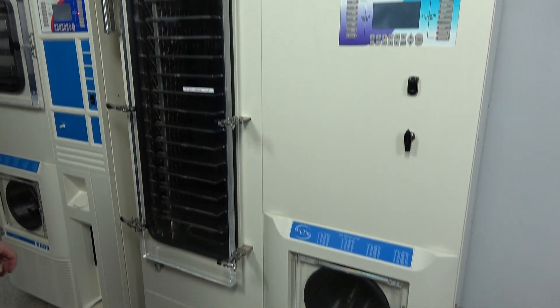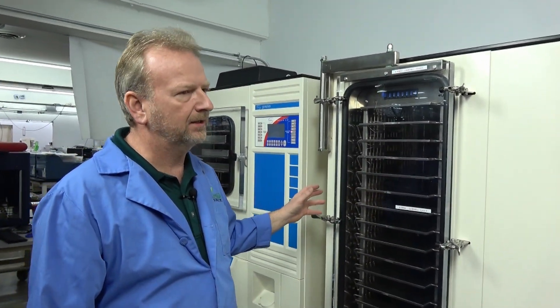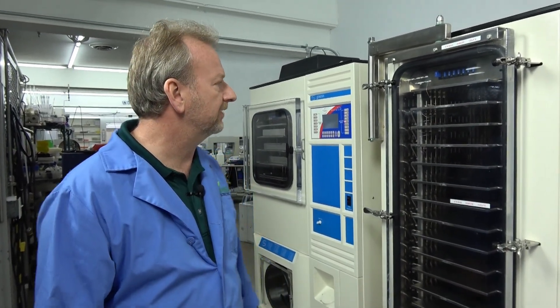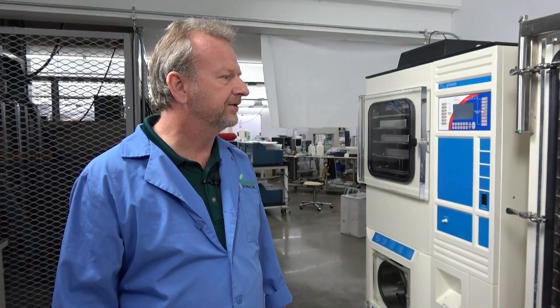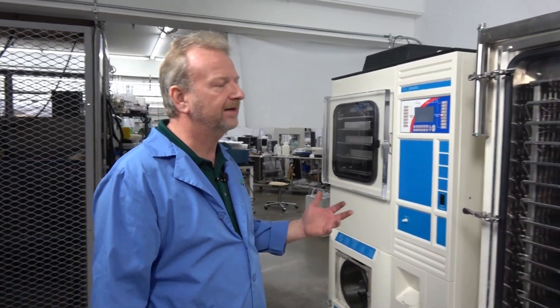One thing I really like about Virtus is that when they build these machines, they build them solid and to last a long time. Everything is industrial grade, so refurbishing them and keeping them going for many more years is an easy option compared to buying a brand new one.